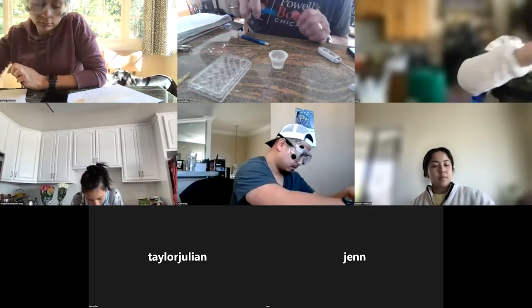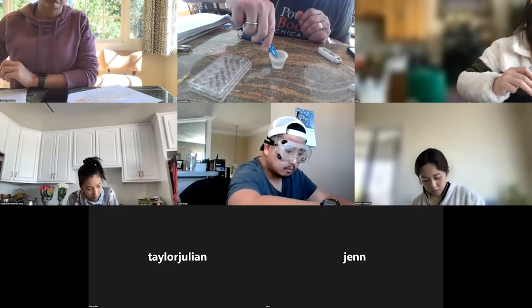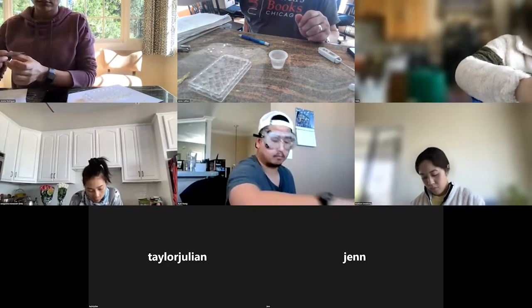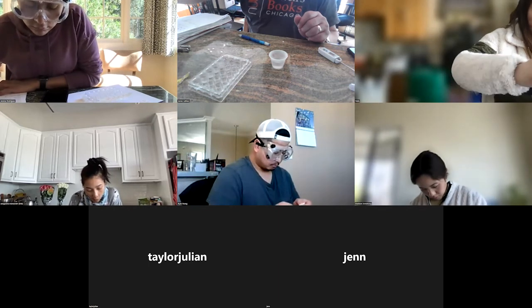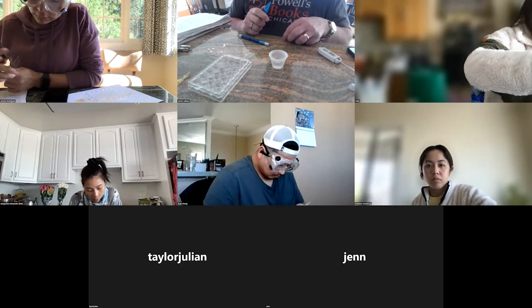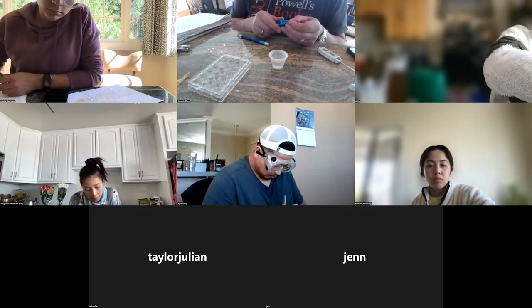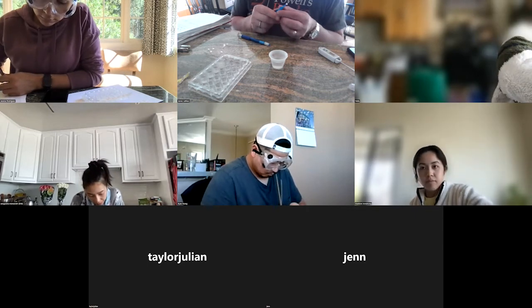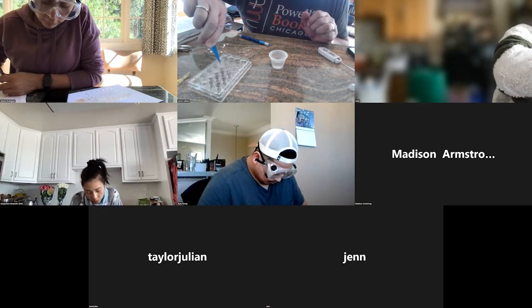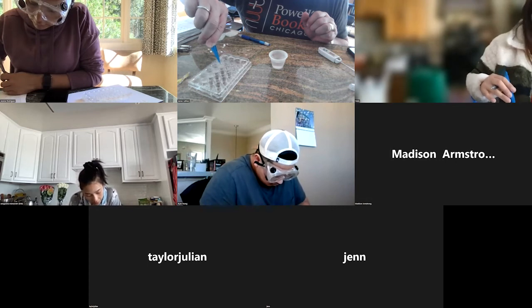Yeah, I found it makes a big difference. You need to have them sitting flat on the bottom. If they're not sitting flat on the bottom, they come up a lot faster. And I started the clock on one of them before it was completely flat on the bottom, and it came up almost twice as quickly. I'm just going to ignore that one, do one more trial.